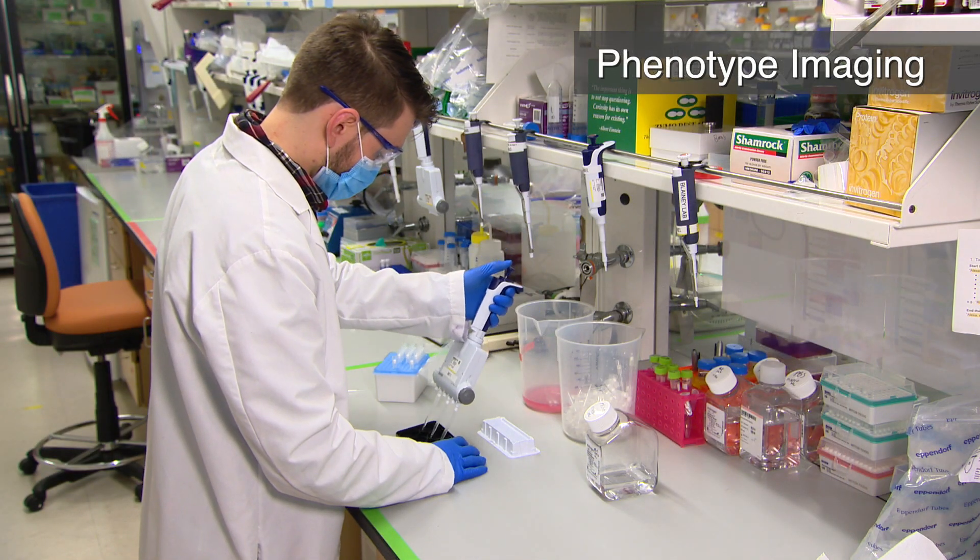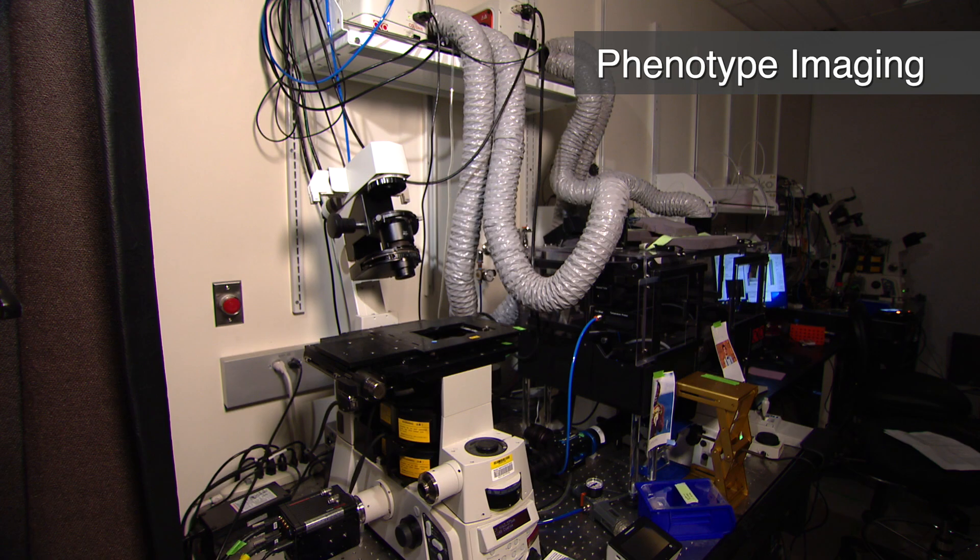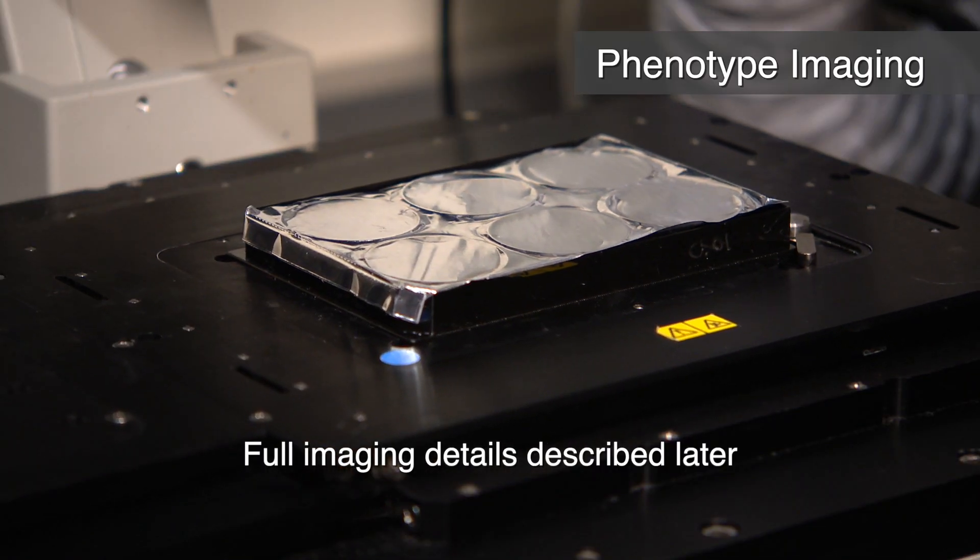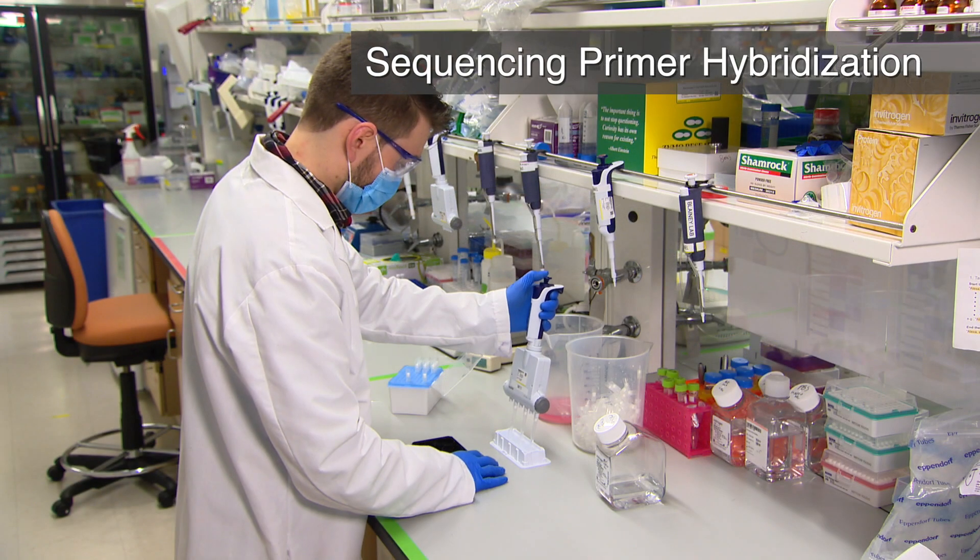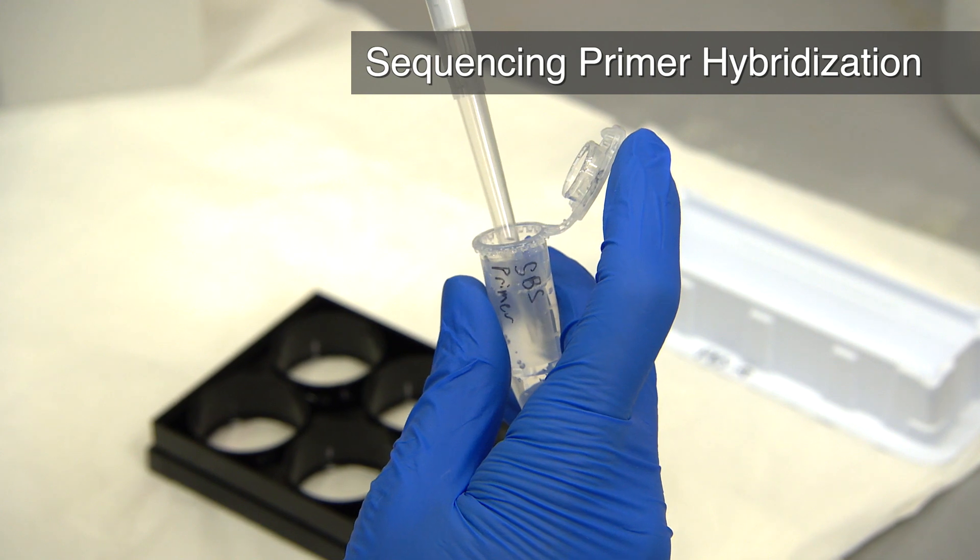The next day, wash 3 times with PBS-T and add 2 milliliters of DAPI solution. Perform phenotype imaging on a high-throughput screening microscope. After imaging, wash the plate 3 times with PBS-T. The sample is now ready for sequencing.